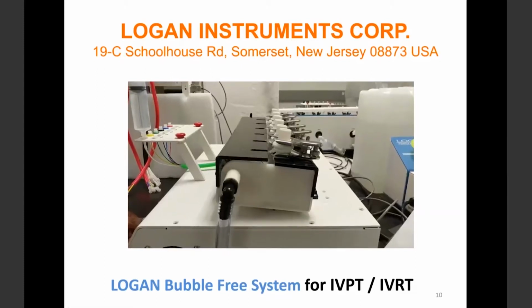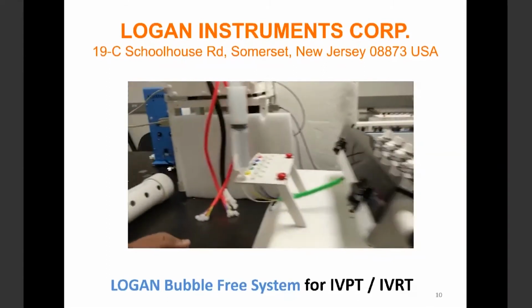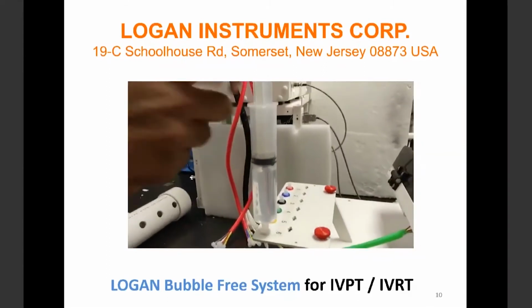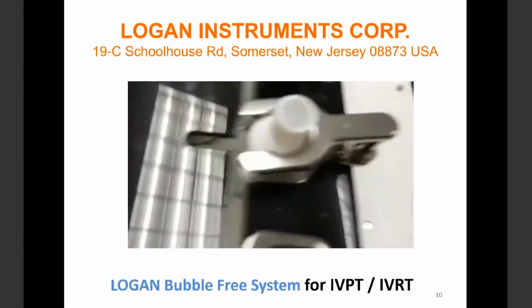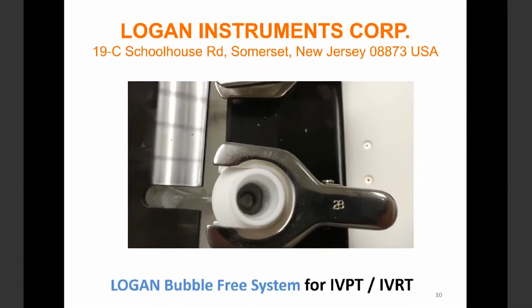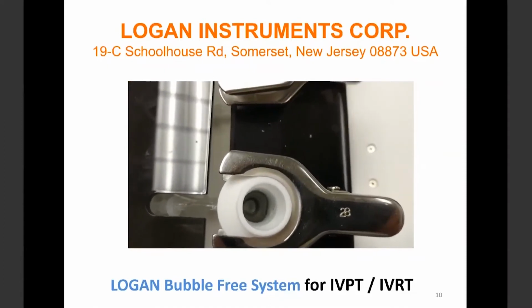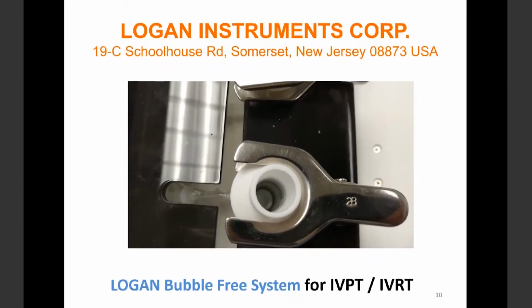So here's the demo. For the demonstration, we only do 1 cell. All the cells tilt, then we fill the media into the cell. You can see the bubbles go out on the top. After that, we press the switch and it goes back to test position. That's what we call a semi-automated system.